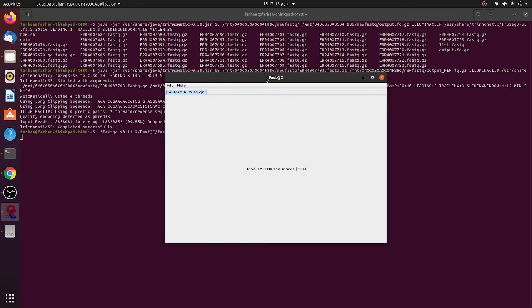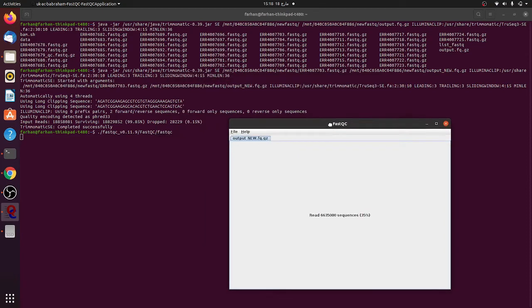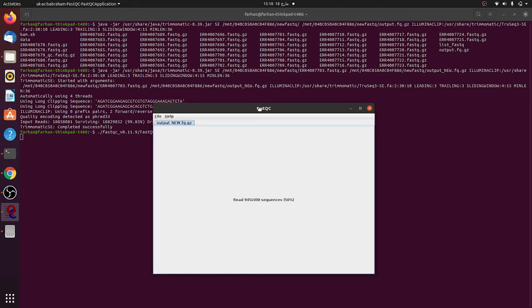Let's see whether the quality of the file, whether the adapter sequences are removed or not, just for a quality check. If not, then what you can do, there are different types. For instance, here you can see that it's using PHRED33. There is another way you can check it by changing to PHRED64 and maybe you can run it again and you can see whether the results are fine or not.